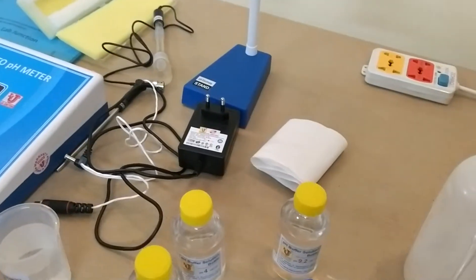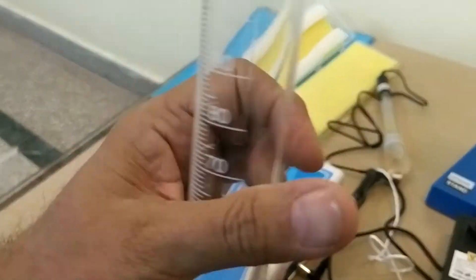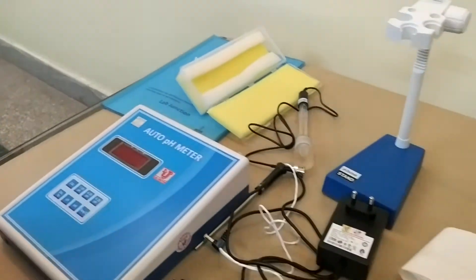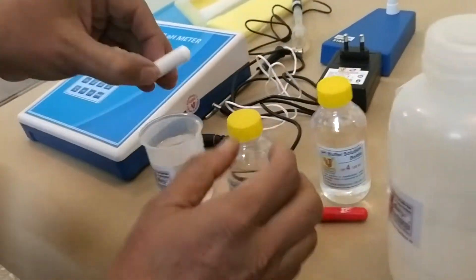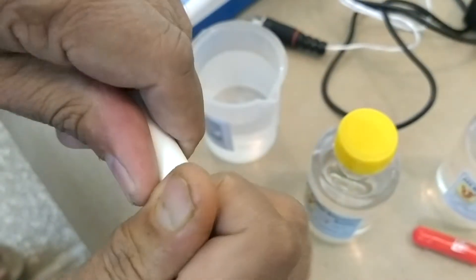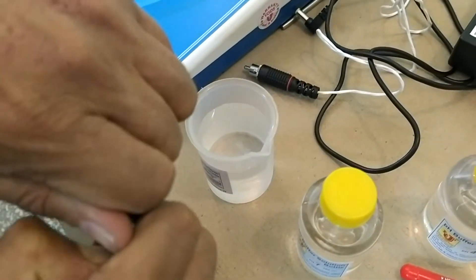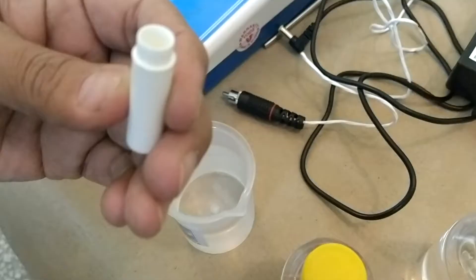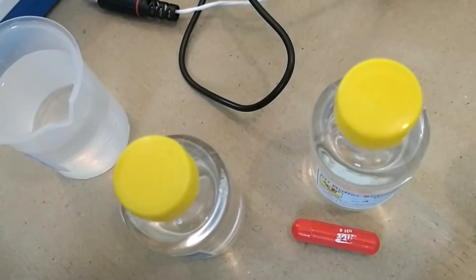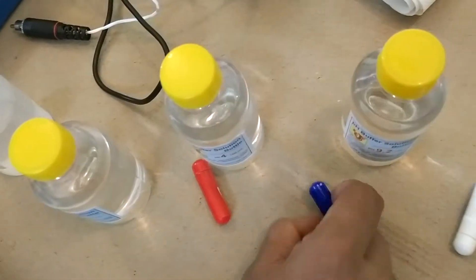You take distilled water and take 100 ml for this. Then you can open this capsule like this, and put the complete powder down into one bottle. Like this, and like this for each one.